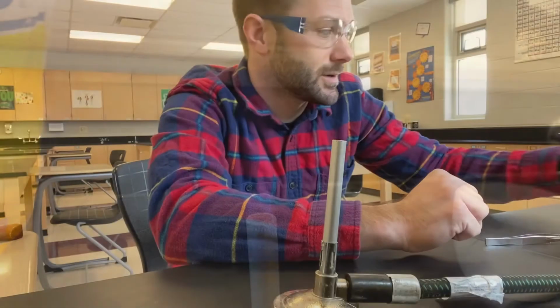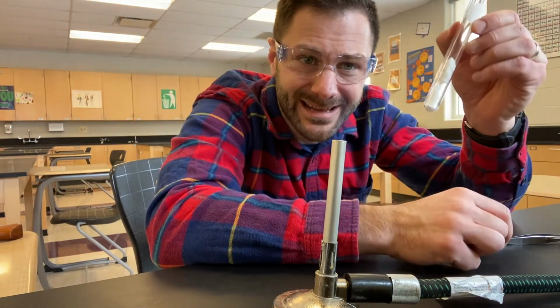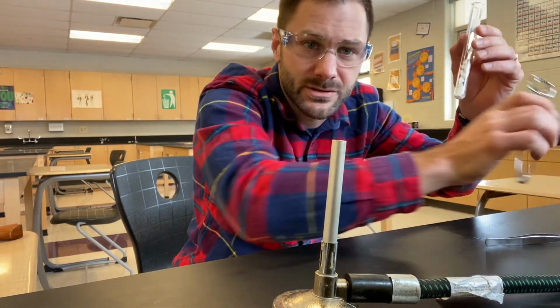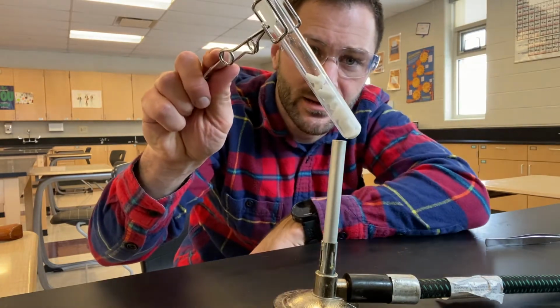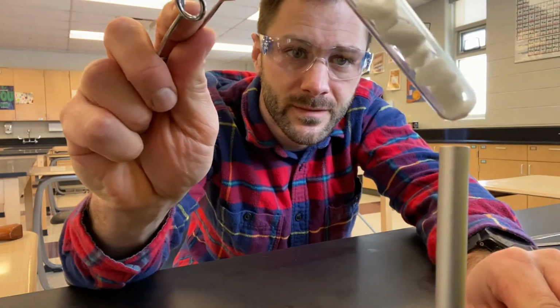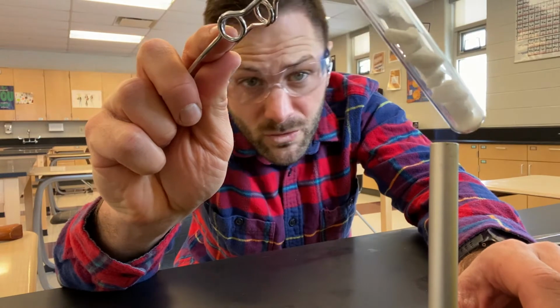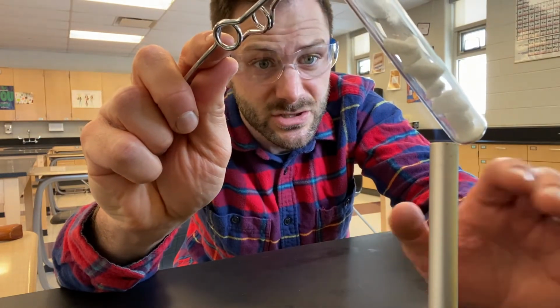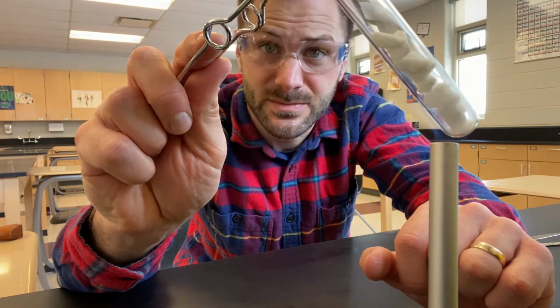What I'm going to do here is burn sugar. I've put it in a test tube, and I'm going to hold it with my test tube holder right into the flame. I don't know if you can see. Let's go closer. I'm holding the base of it right in the flame, kind of at an angle to increase the surface area. My goal is to get that test tube as hot as possible.